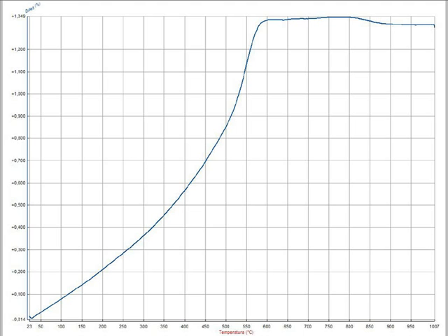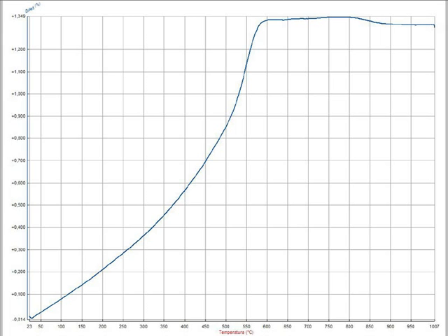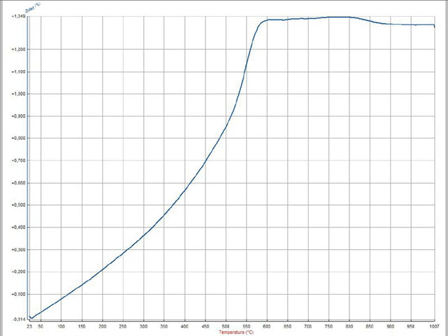One of the many advantages of the optical dilatometer is the possibility to carry out expansion tests, even on materials which cannot be measured on traditional dilatometers. This, for example, is the plot of the thermal expansion measured on an incoherent sample of quartz sand. This kind of material cannot withstand the pressure, even minimal, of a push rod measuring system, but it can be measured with no problem on the optical dilatometer misura LT.